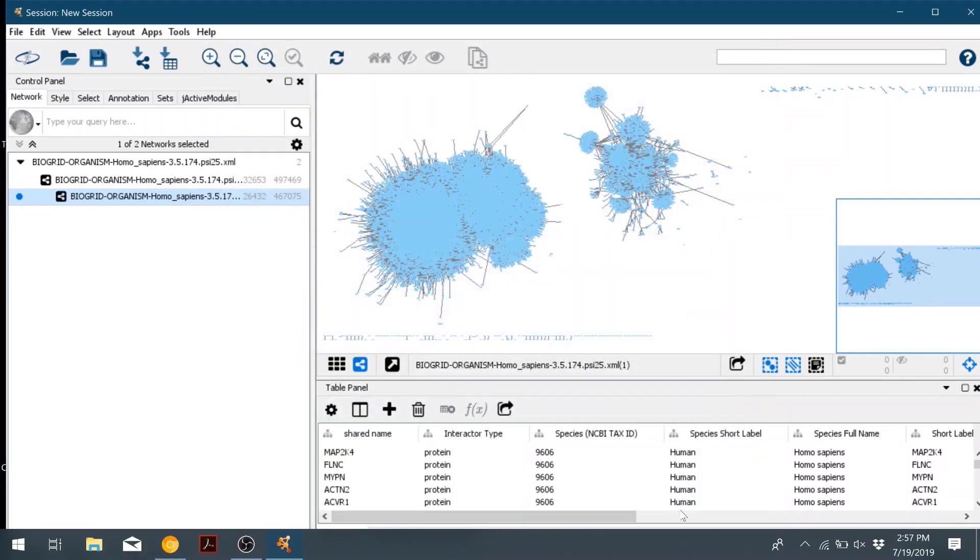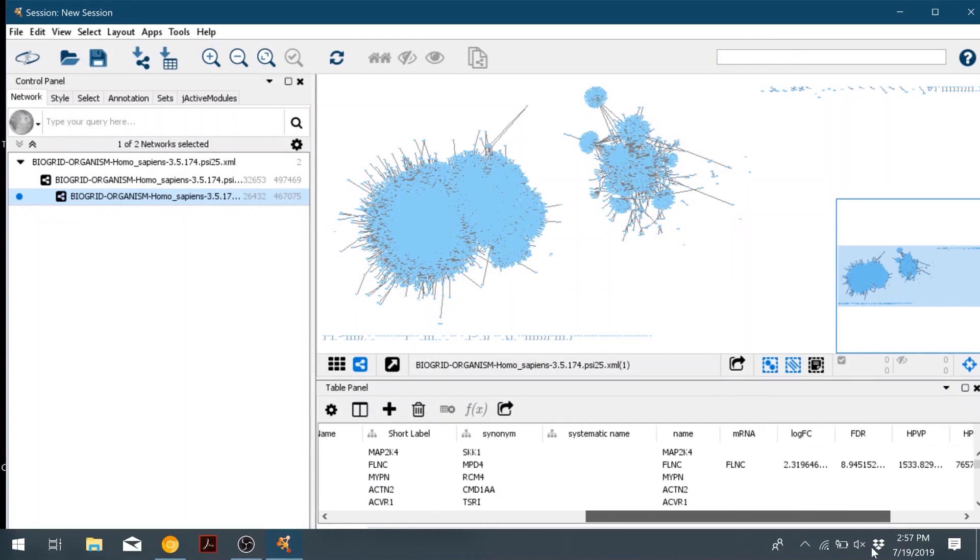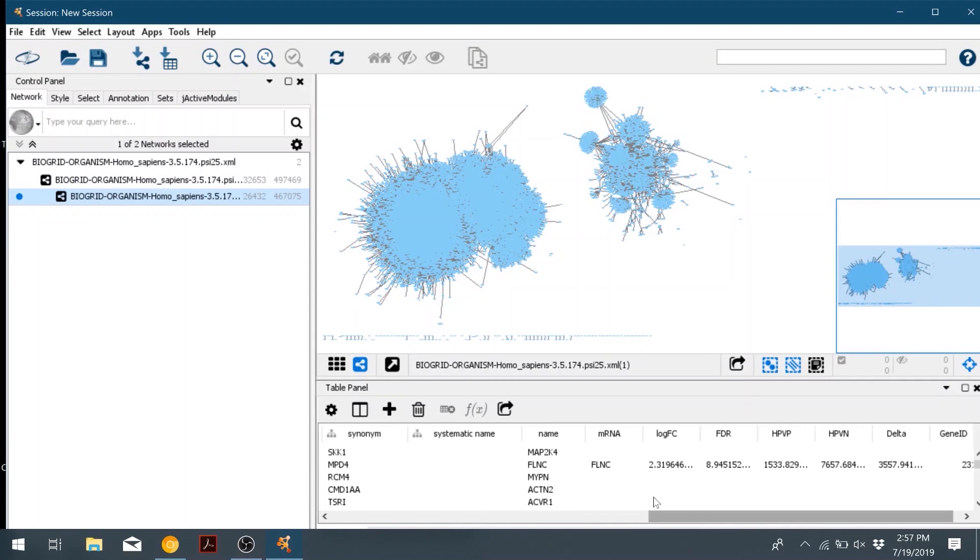So now using our differentially expressed gene information, we're going to color the nodes based on their logfc values.